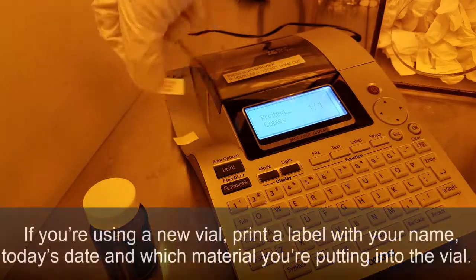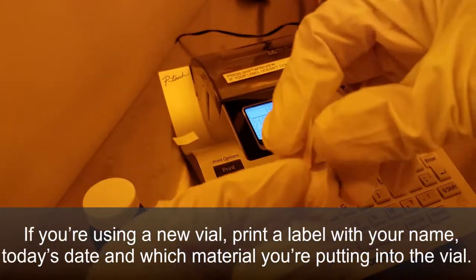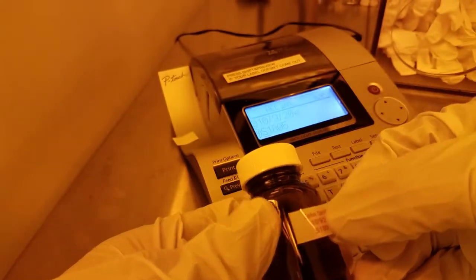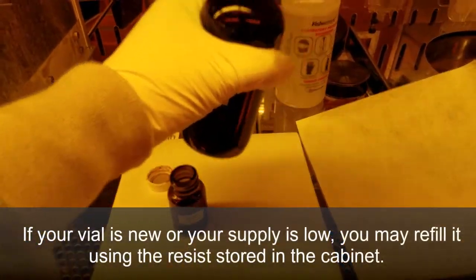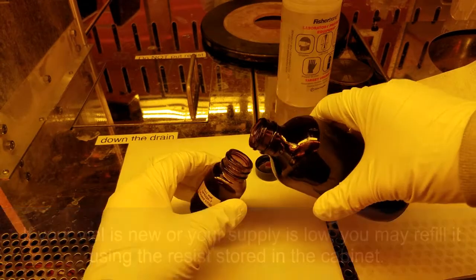If you're using a new vial, print a label with your name, today's date, and which material you're putting into the vial. New vials may be purchased from the QNF stockroom. If your vial is new or your supply is low, you may refill it using the resist stored in the cabinet.